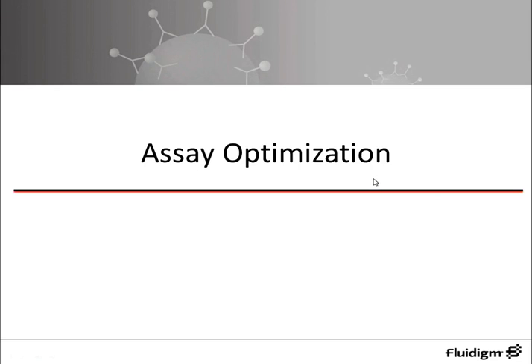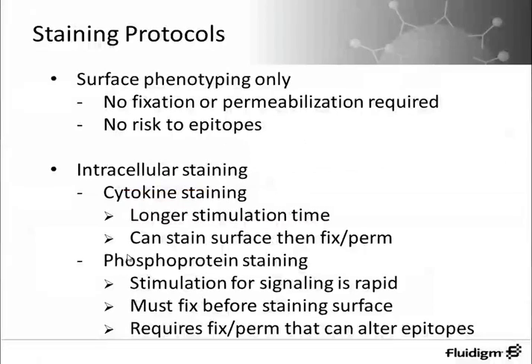I'd also like to talk a little bit about assay optimization, and I just wanted to mention that some of the tips that I'm going to discuss in this part of the talk came from Jonathan Irish's lab at Vanderbilt, and Brent Farrell will be talking later about research done in that lab, but they've really shared with us at Fluidigm some of their expertise in assay optimization.